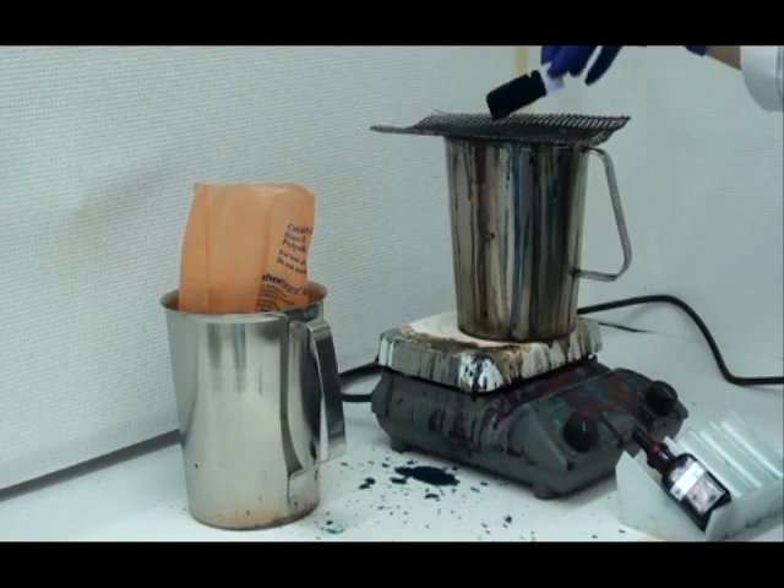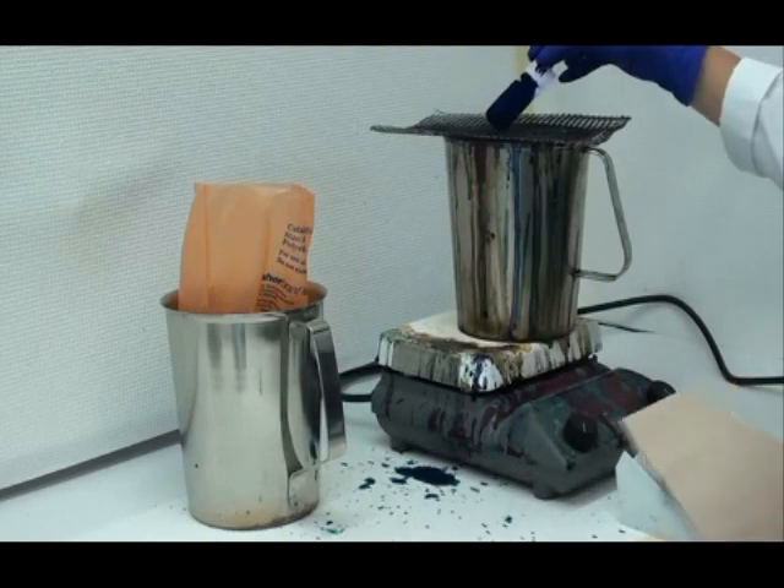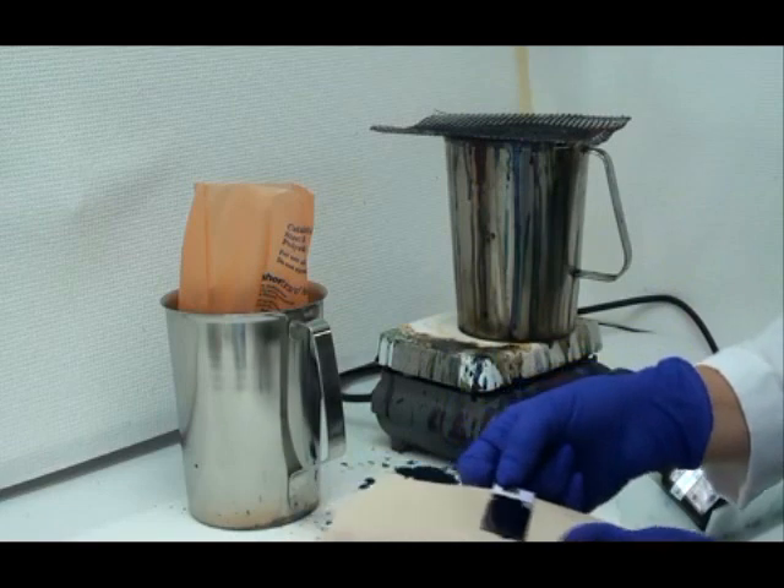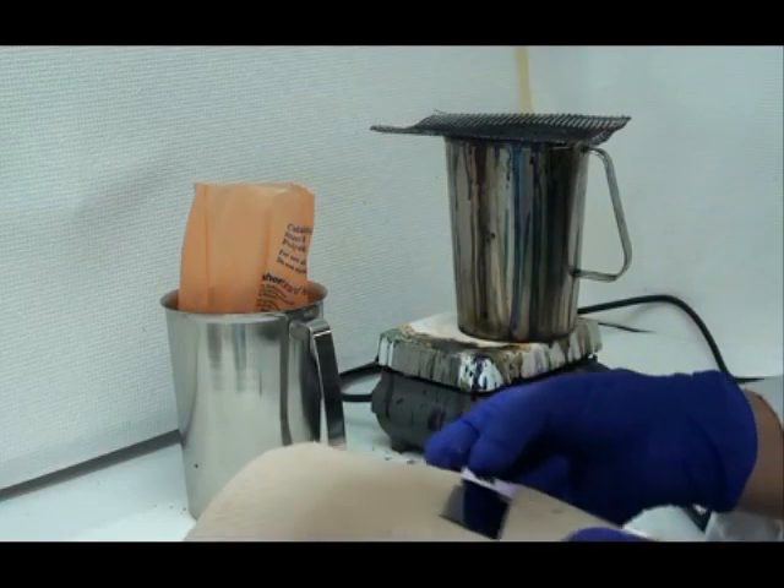After three to five minutes I retrieve my slide, allowing any excess stain to drip off into the water bath. I then place the slide on a paper towel and take it back to my station to finish the staining procedure.